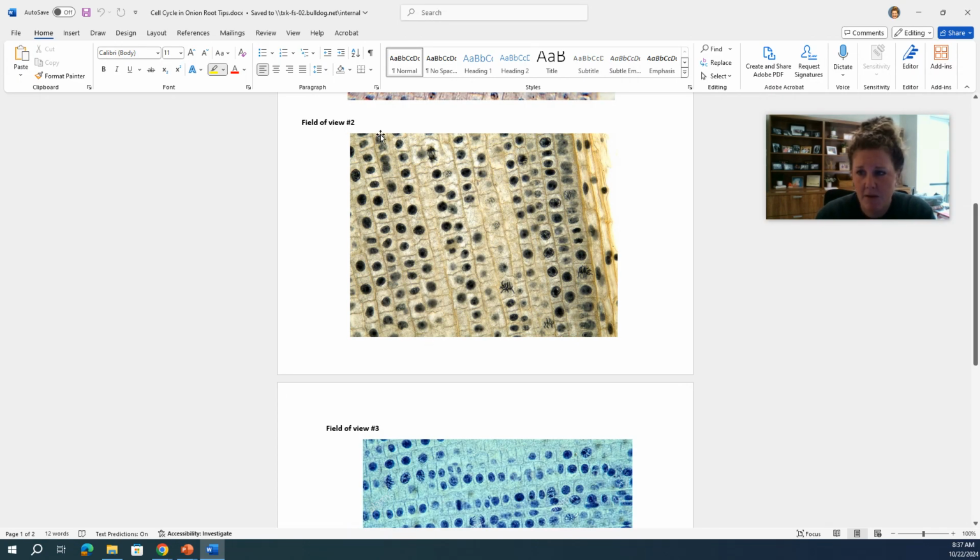Now, what I would recommend, and I know this can be hard on the eyes, so you may need to take a break, is this: if this is my field of view, and keep in mind it is a circle, not a rectangle, I would maybe start in the top left, and I would either go down and back up.